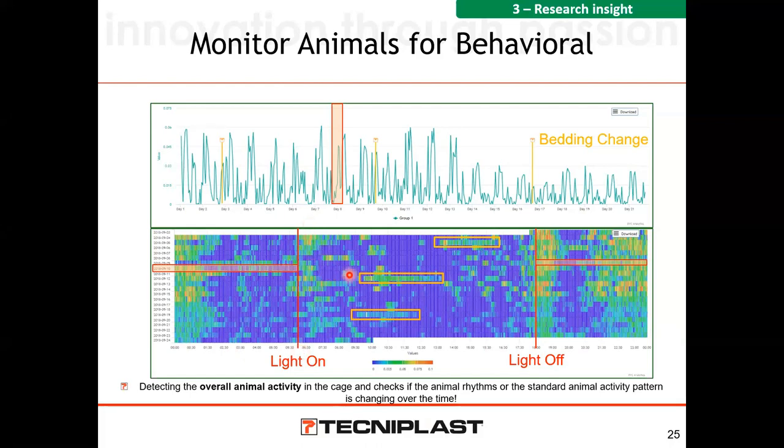And there's a lot that we can pull from this that we haven't even seen. I mean, this incidence here could be mice being weaned, a weaning activity, or mice being weighed. So they're very active again during the day when they should not be active; they should be active during the night.